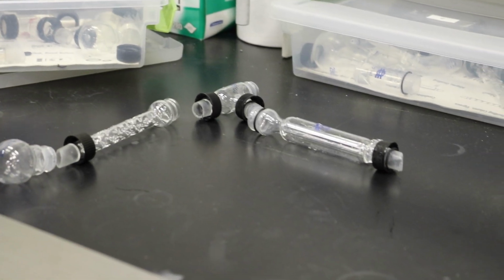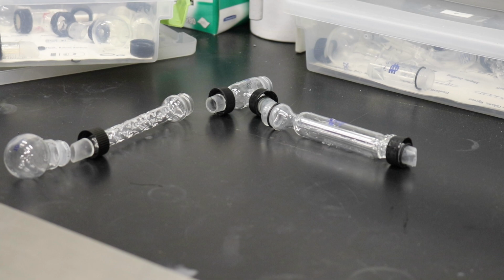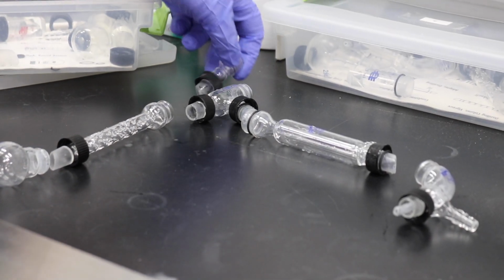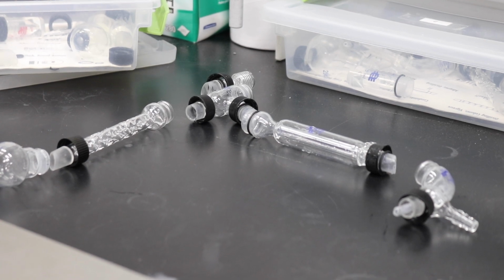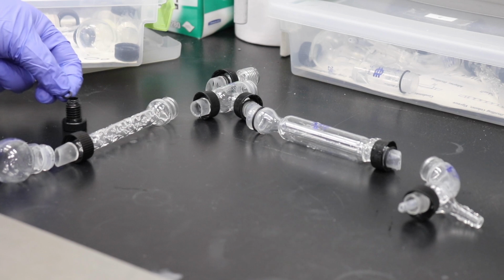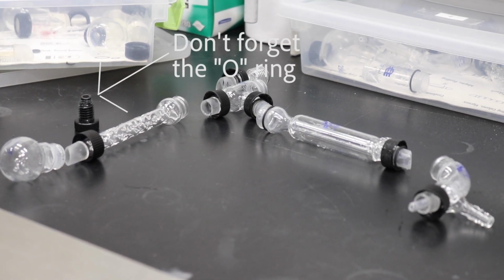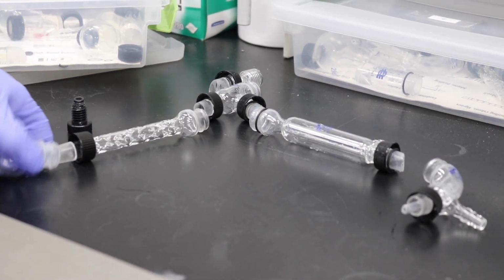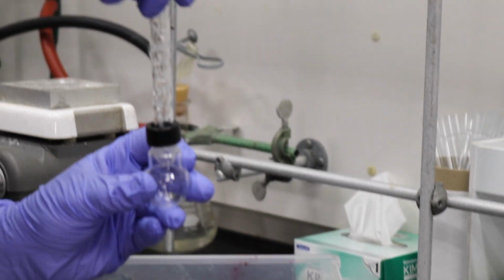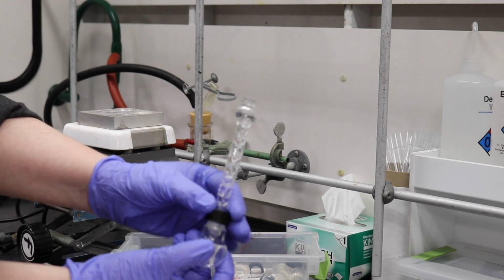Now we're going to show you how to set up and perform a fractional distillation. We use the same glassware as we used in the simple distillation, and as you can see, we're putting the pieces out here. The only difference is there is a longer column. It's called a Vigreux column. You can see here we have the O-ring for the thermometer and the round bottom and all the pieces we had for simple distillation.